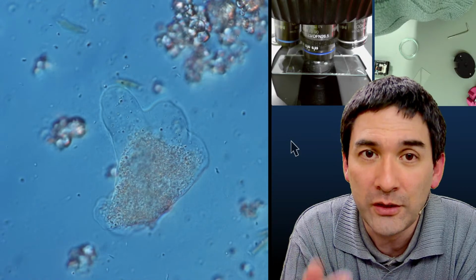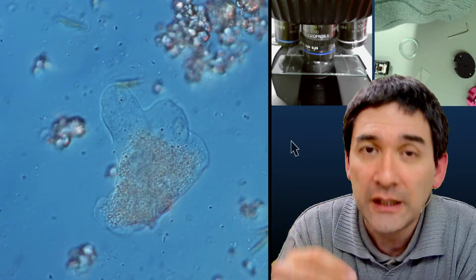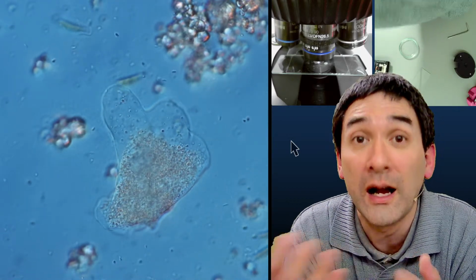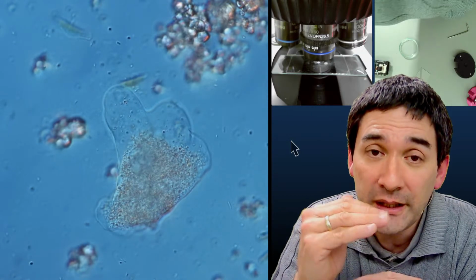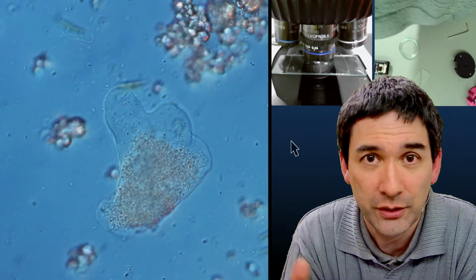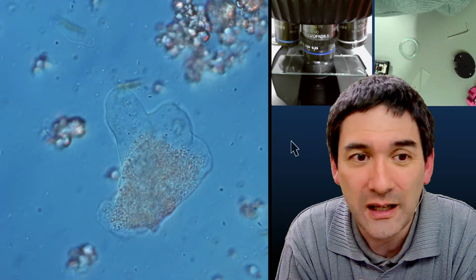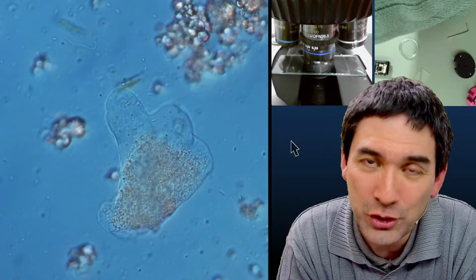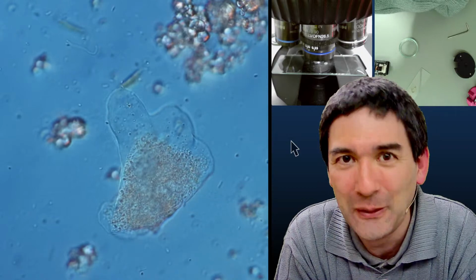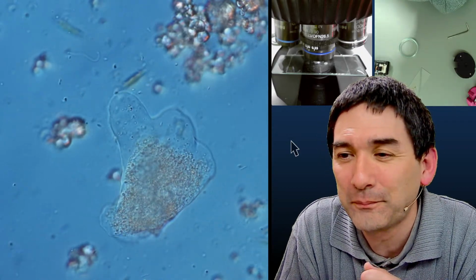Then go out and make sure that some snowflakes land on the nail polish, and allow the nail polish with the snowflake to dry. Then you will have an imprint of the snowflake in the nail polish, a permanent mount of the nice crystals. If you check my other channel, I also made videos about this a couple of years ago. Snow under the microscope is quite nice as well.